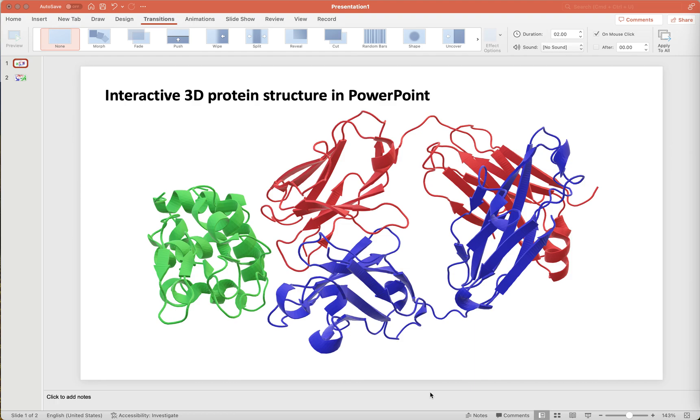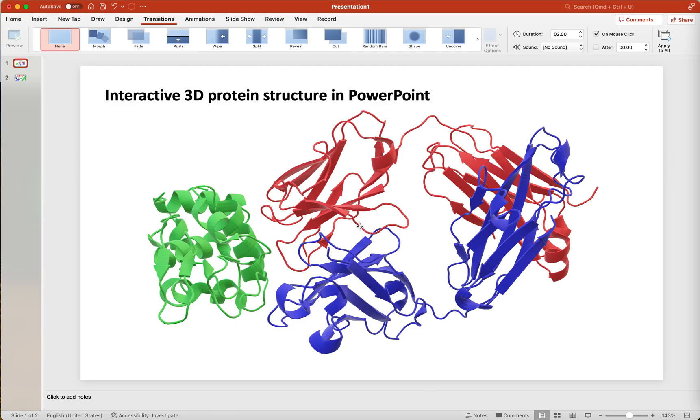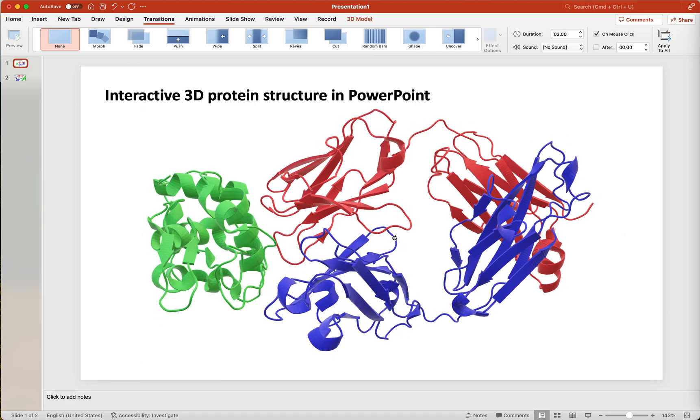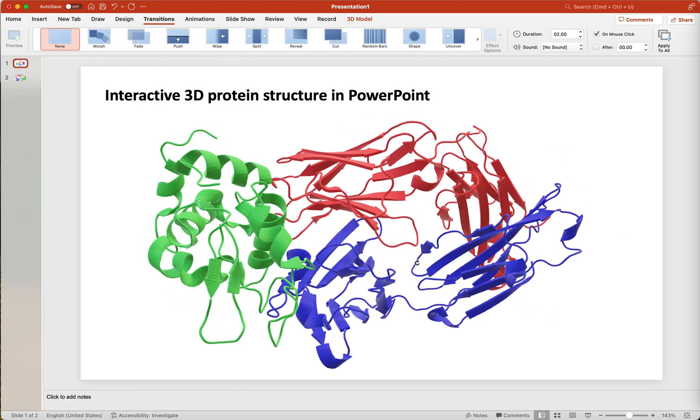Here's a quick tutorial on how to generate a three-dimensional protein structure object in PyMOL and insert it into a PowerPoint presentation. This will allow you to change the orientation of your protein structure within PowerPoint.